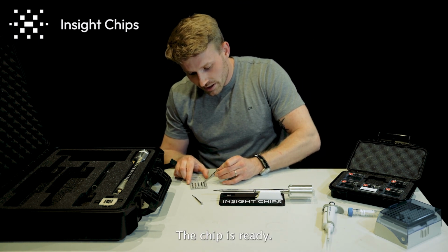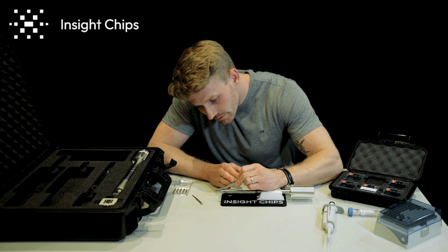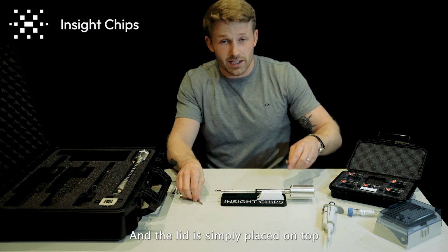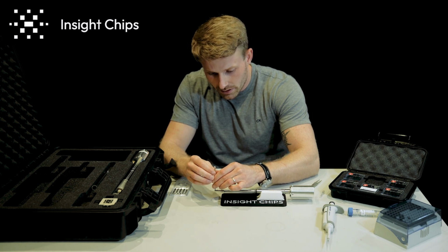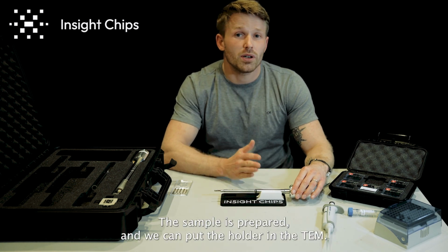The chip is ready. All we need to do is flip it over so that the O-rings in the holder will seal the liquid inside the chip. And the lid is simply placed on top again. The screws are screwed in, and that will be it. And that's it. The sample is prepared, and we can put the holder in the TEM.